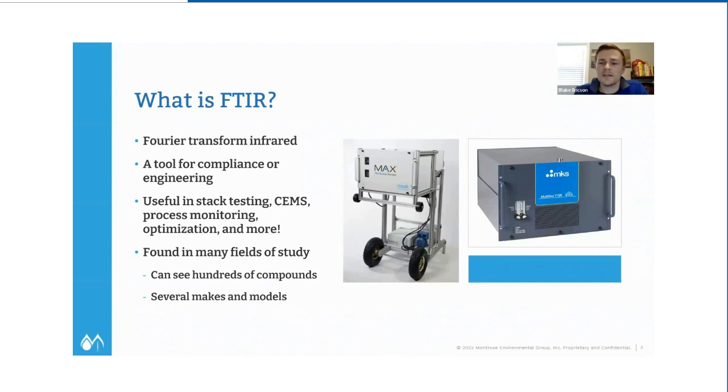Really, the list of places where these things are is relatively endless. And like I said, found in many fields of study, and the beauty of the FTIR is that it can quite literally see hundreds of compounds, and that's not an exaggeration by any stretch of the imagination. It is a very versatile tool. It's really good for a lot of things, but it should be noted that it's not perfect.